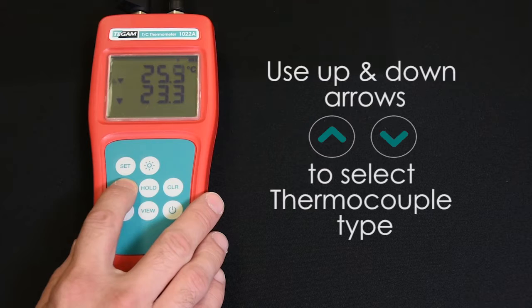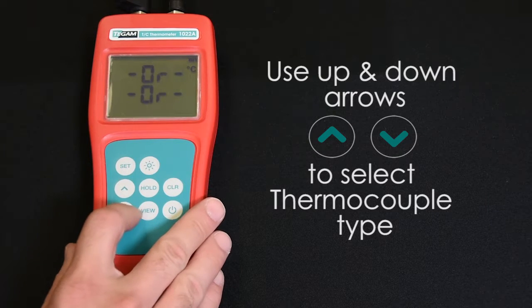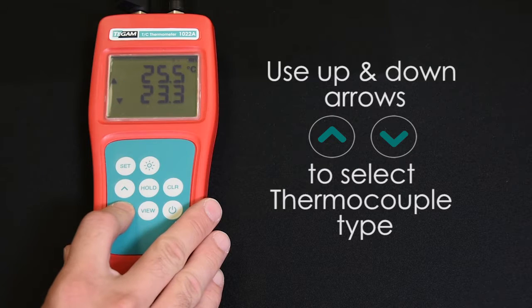To change the thermocouple type, press the up and down arrows until the correct thermocouple type is flashing on the LCD.